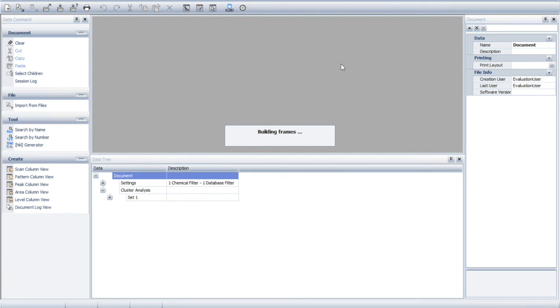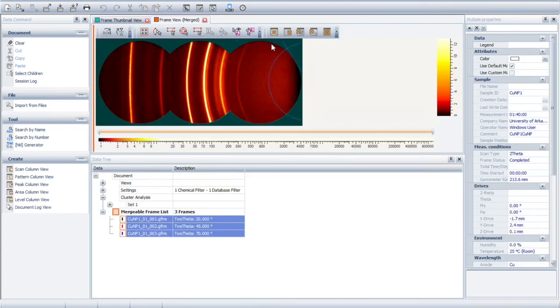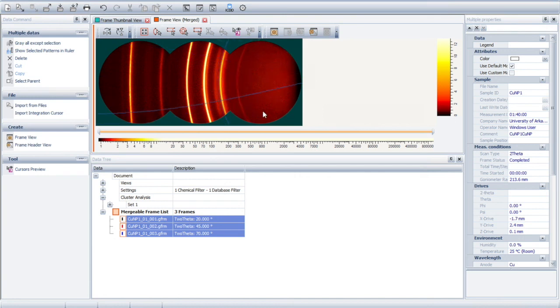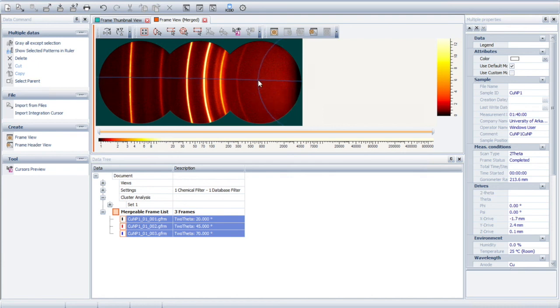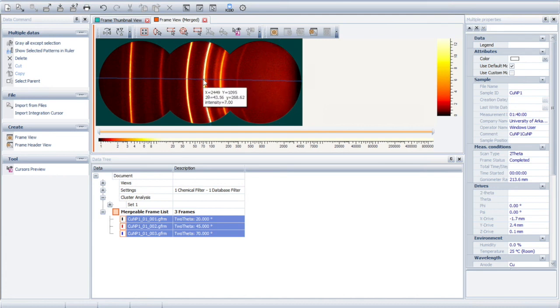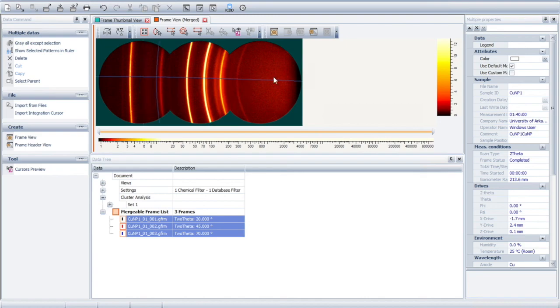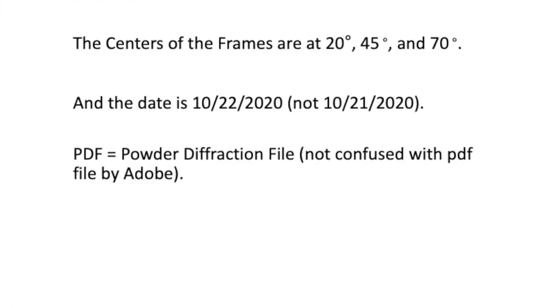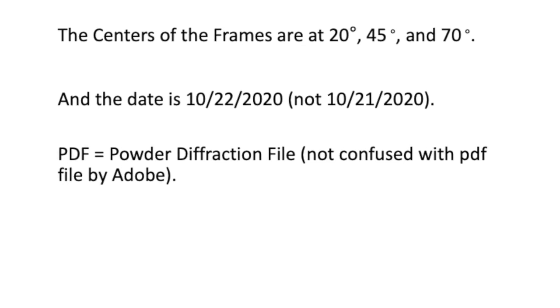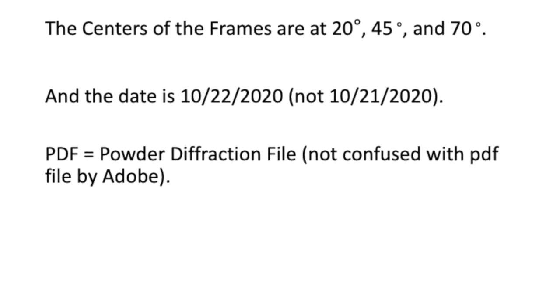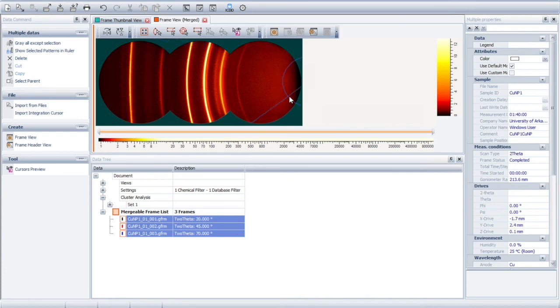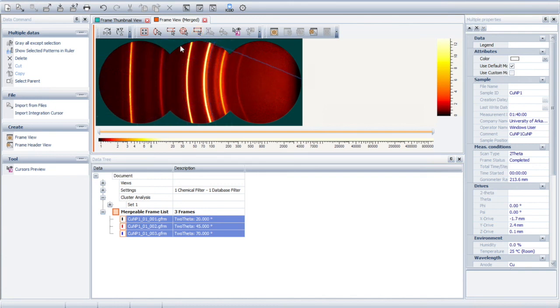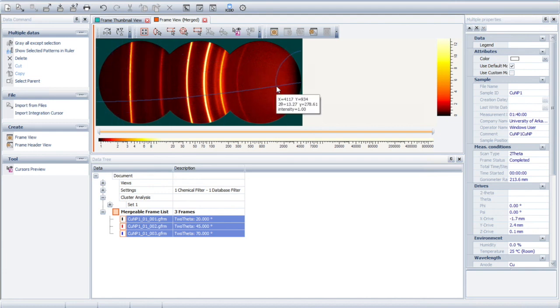It will show up in this screen. Okay, there are three frames. Each run things called frames. And the program automatically kind of stitches together. So this one here, the two theta value over 22.5. And this one is 22.5 plus 20. So 45 or something. And then this one is like 70 something. Anyway, so we have these rings. These are the Debye pattern. These are fine powder, I mean, nanoparticles. So, by looking at this, you can tell a few things.